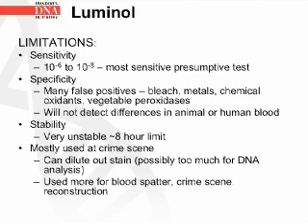Limitations of luminol. It is sensitive up to dilutions of 10 to the power 6 to 10 to the power 8. It is the most sensitive presumptive test. It does, however, have many false positives: bleach, metals, chemical oxidants, and vegetable peroxidases. It will not detect the differences in animal or human blood. It is also very unstable. There is only an 8-hour limit.